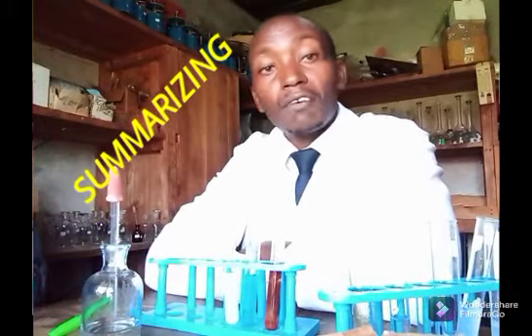But I have three cations that form a precipitate that dissolved. That is zinc, lead, and aluminium. Basically because the three hydroxides are amphoteric in nature. And if they are amphoteric in nature, it means they will dissolve in excess alkali, that is excess sodium hydroxide.